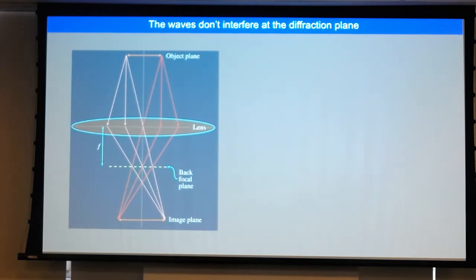Yeah. Okay, so this is a simulation I really wanted to do but ran out of time, of what exactly this looks like as you change the focus. It turns out that the only thing that changes here, if you say that this remains the back focal plane, and you move your object up and down, of course you're going to do things to the contrast of the image. But at the back focal plane, you're going to see those three spots from the three waves, and the only thing that's going to happen as you move the specimen up and down is that the colors of the two outer spots are going to change. That is, the phases are going to change. And that's just because the difference in path length between this wave and that wave changes when we change the height of the specimen.